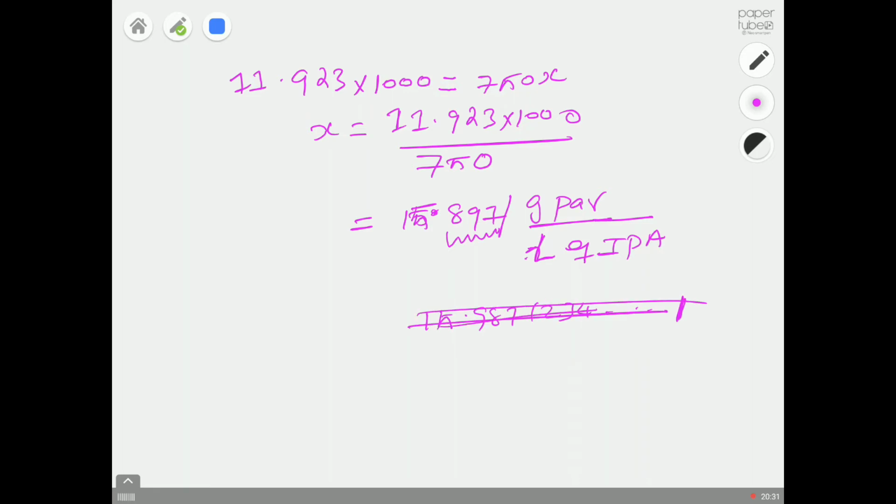So this is your solubility value as well. Sorry, your delta C. So I think we fairly covered some basics, like how to convert the units and how to play with the numbers based on the solubility data and your initial experimental conditions. So I think this is enough.